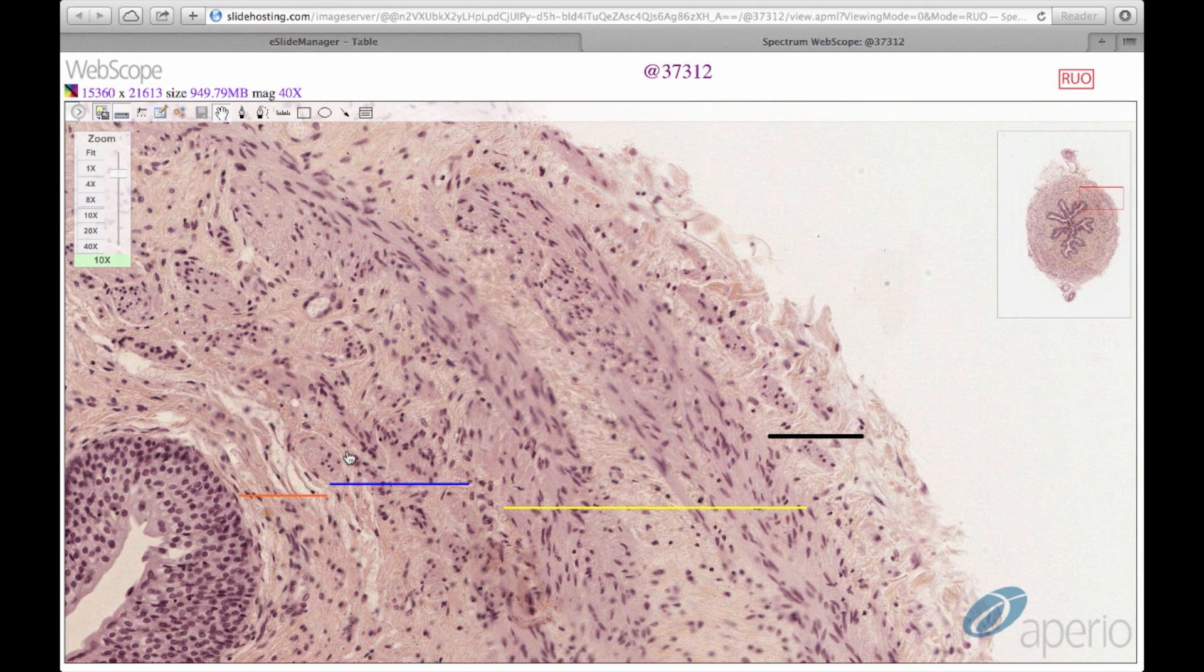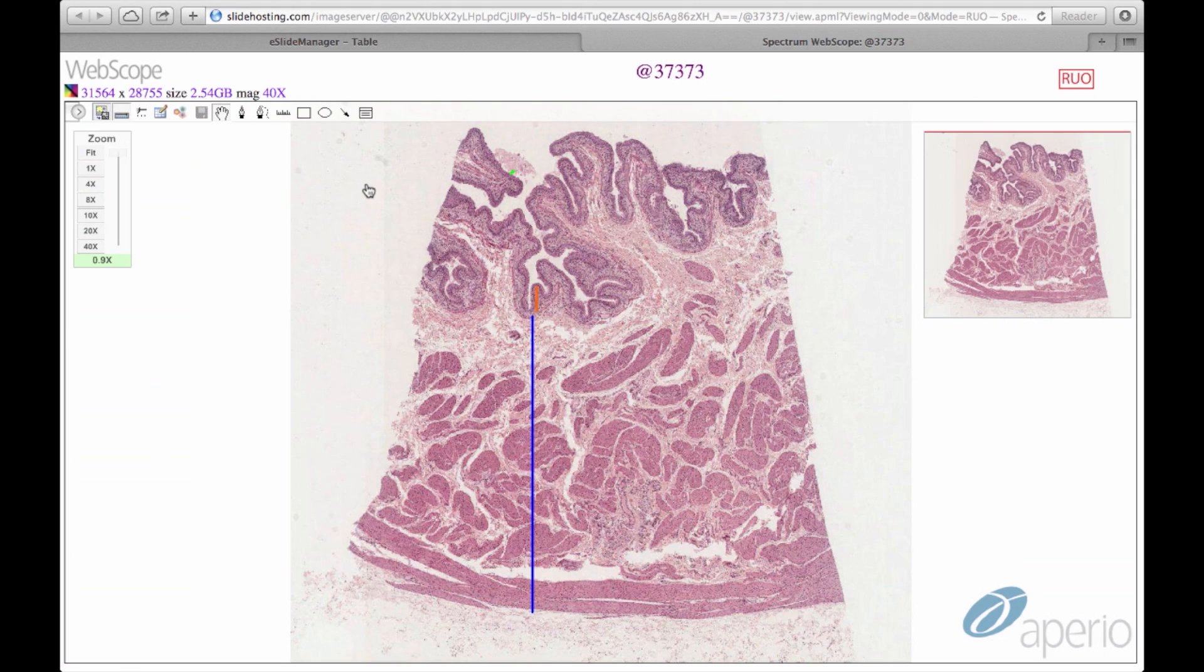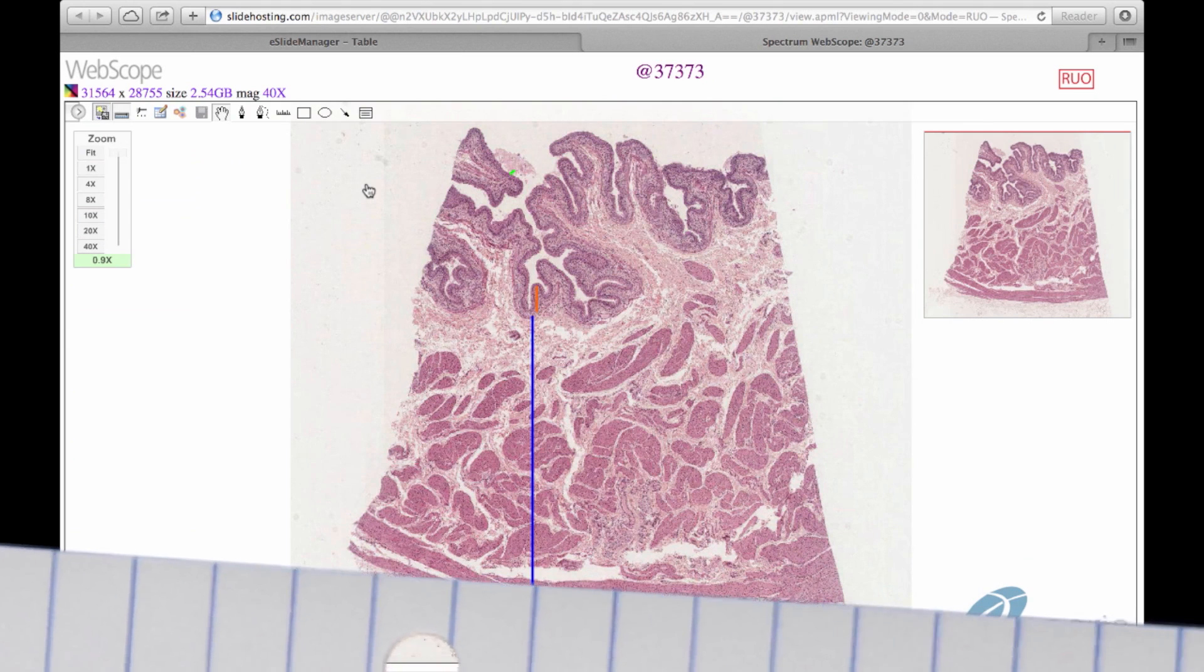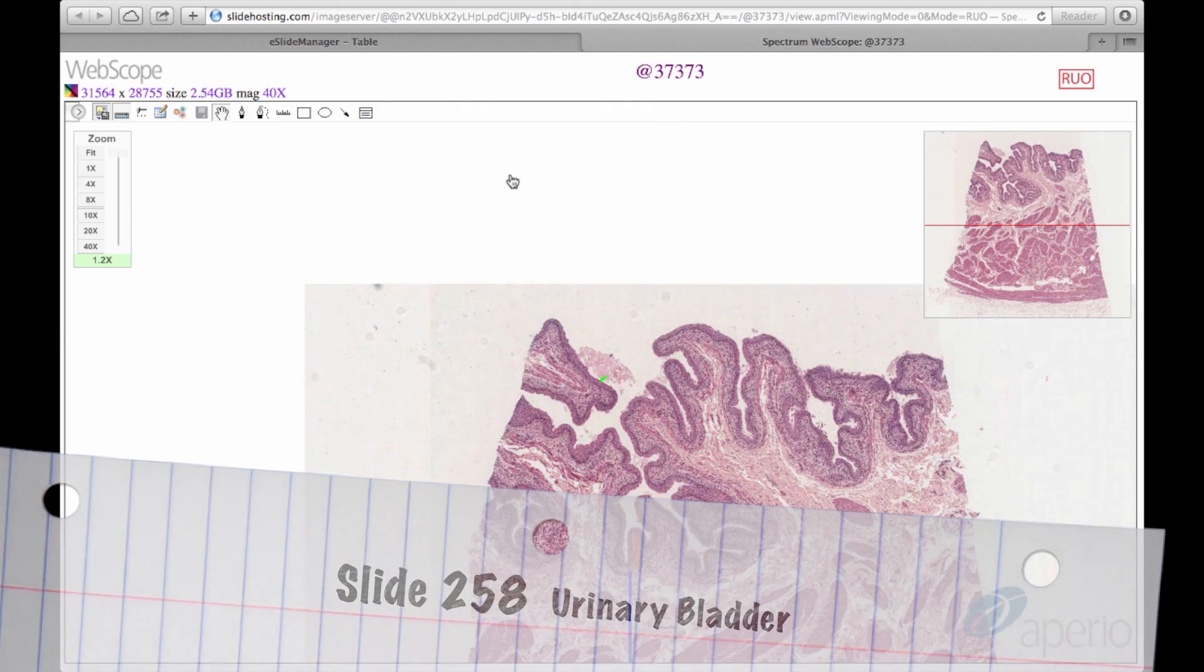For review, make sure you practice identifying serosa and adventitia on this slide. Our final slide of the day is slide 258, which is a section of the urinary bladder stained with H&E.